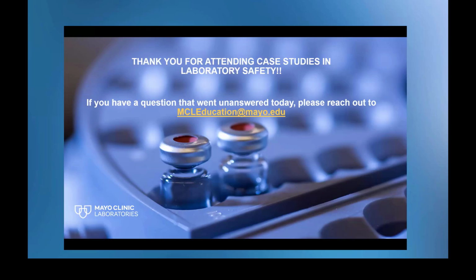don't think about the drains because we don't want contaminated water going into the sewer, especially if you've been hit by a corrosive or something like that. Here at Mayo, again, we're a large facility with a lot of resources. Our facility staff takes care of this, and I believe they have an enormous bucket for testing. But in the real world, you may have a giant mess on your hands, and hopefully you don't have a drain in the floor though if you have a corrosive or something else that shouldn't be in the sewer.